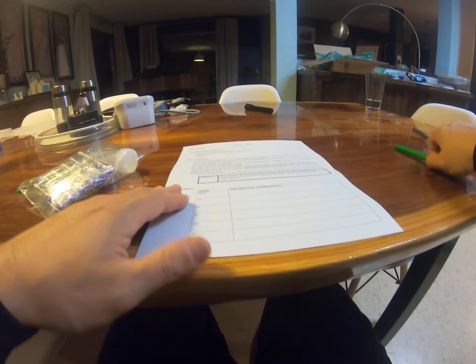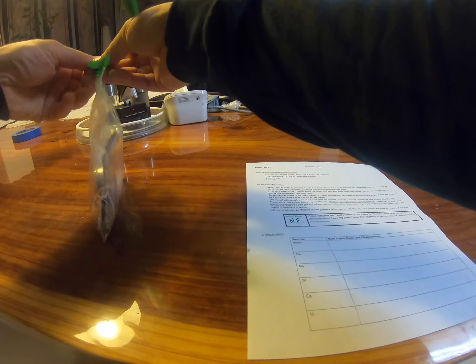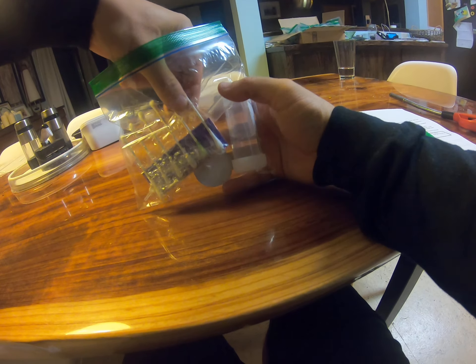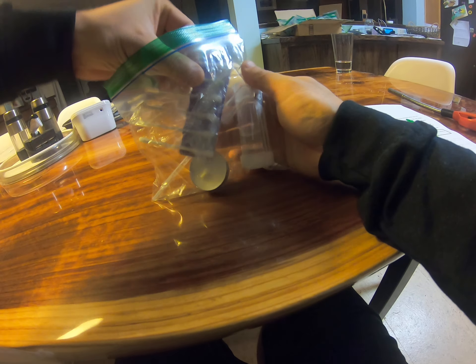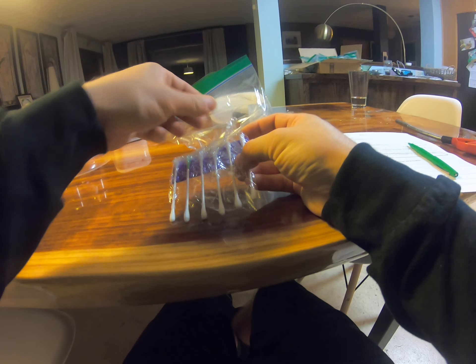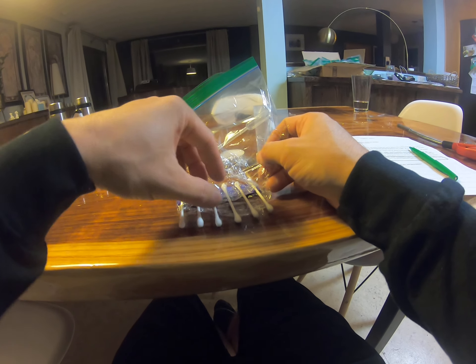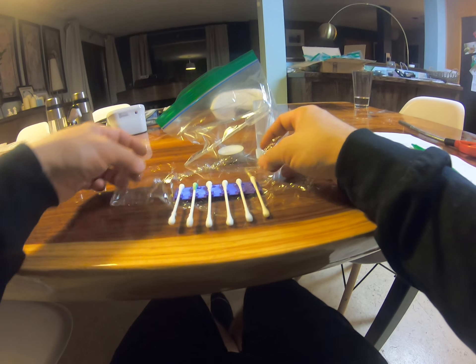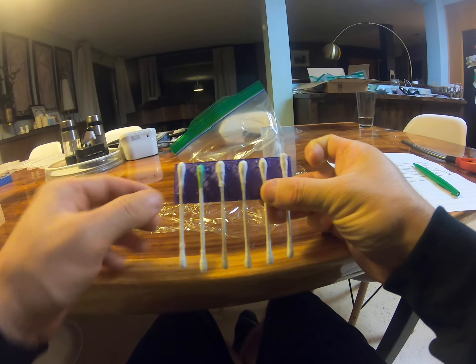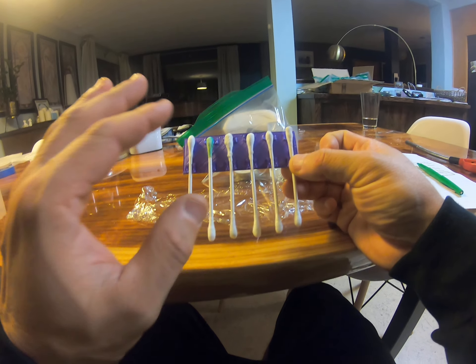If you could just read through this and get your parents' approval. Make sure you watch me do my demonstration right now. And then when you're ready, if you could just initial there. Chemistry has risks, but we mitigate or minimize any of the risks by using appropriate safety precautions and wearing safety glasses. This is really safe when done properly. So we'll just practice, go slow on all the steps, no rush, and it should be a lot of fun.